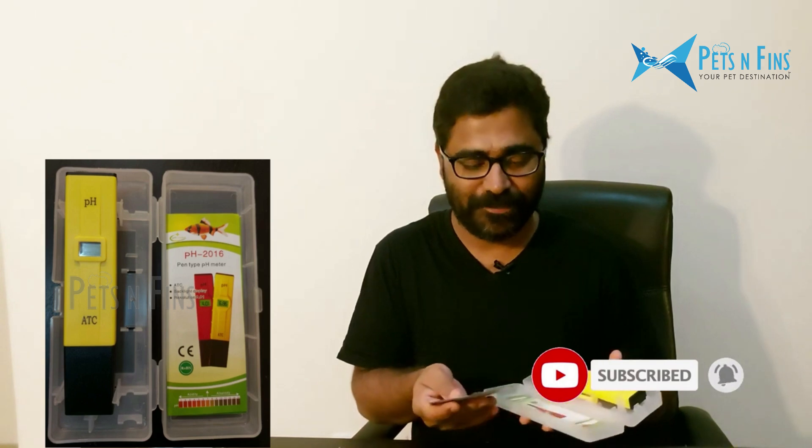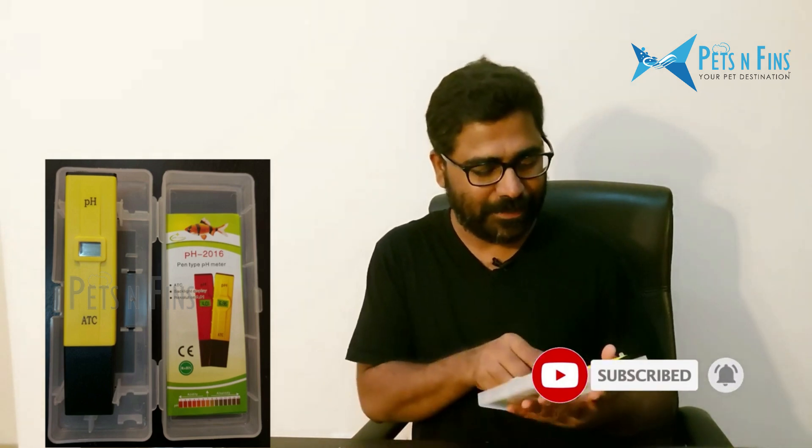Hi friends, welcome to Pets and Fins. This is a video of the PHMeter brand ATC.